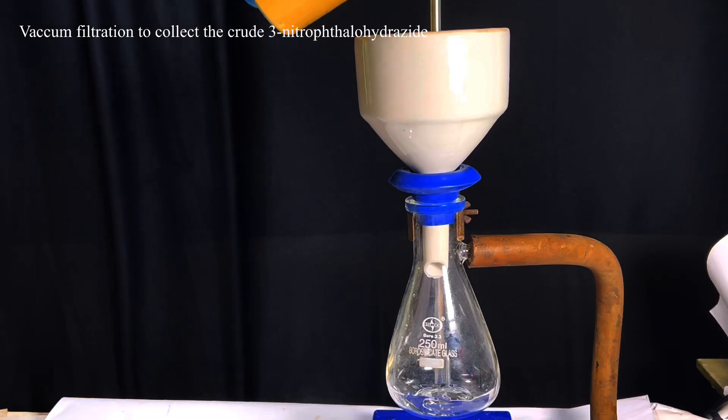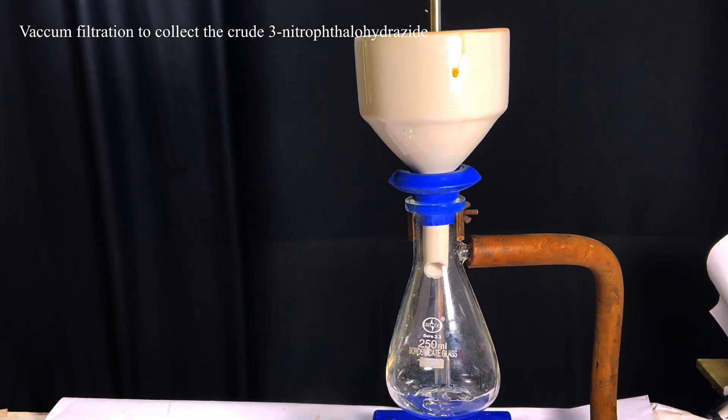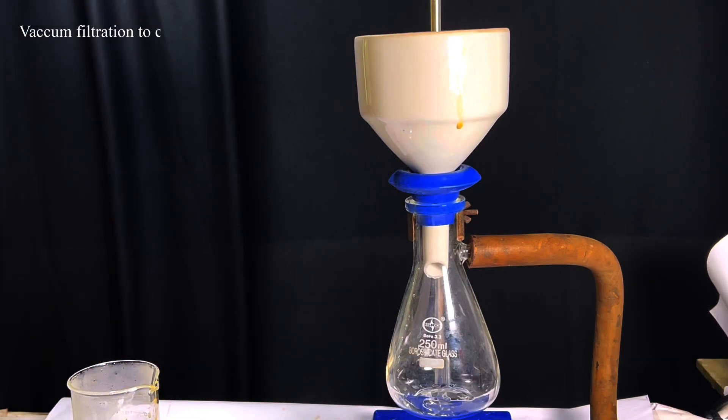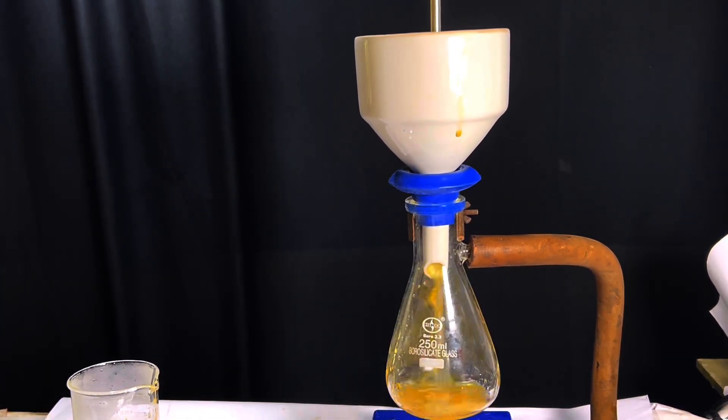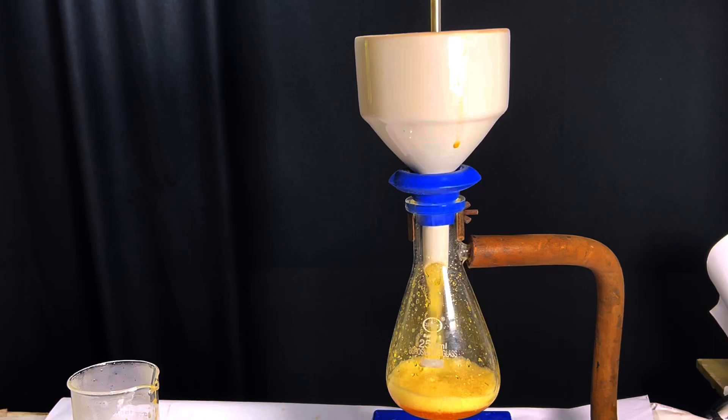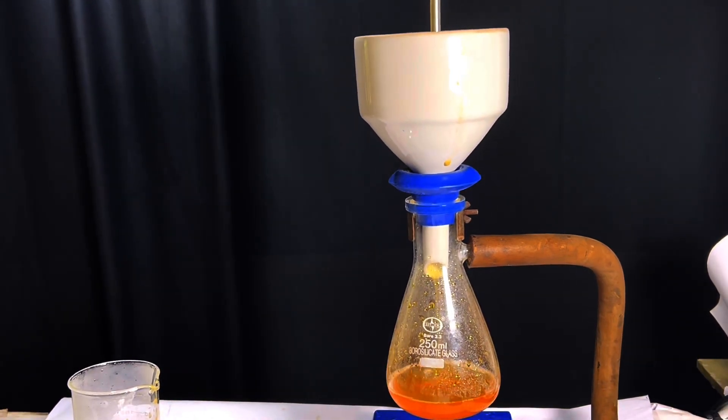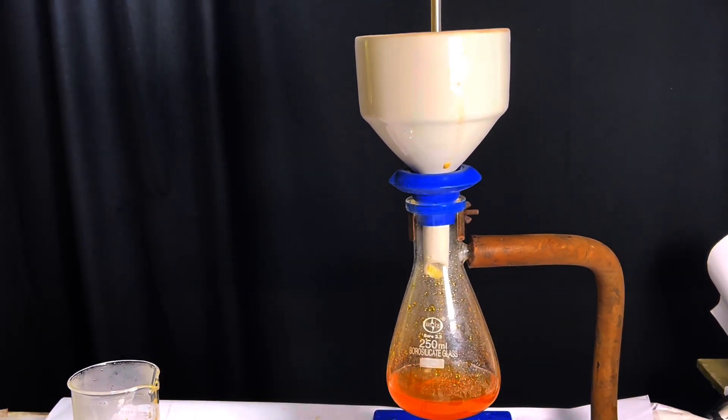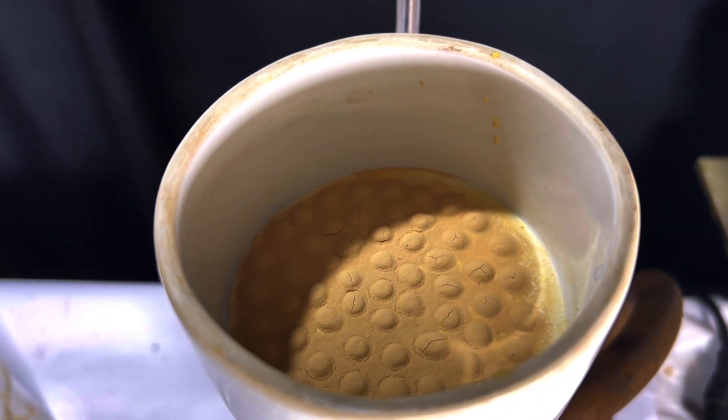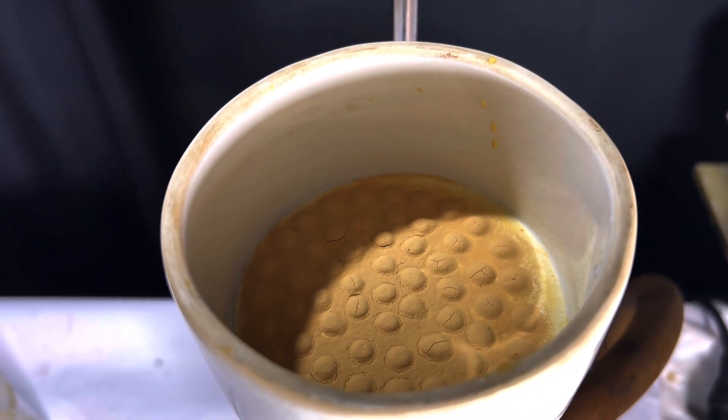Then filter the crude 3-nitrophthalhydrazide. I am using a vacuum filtration method. Be careful not to splash chemicals while transferring from one container to another. This is the crude compound 3-nitrophthalhydrazide after filtration.